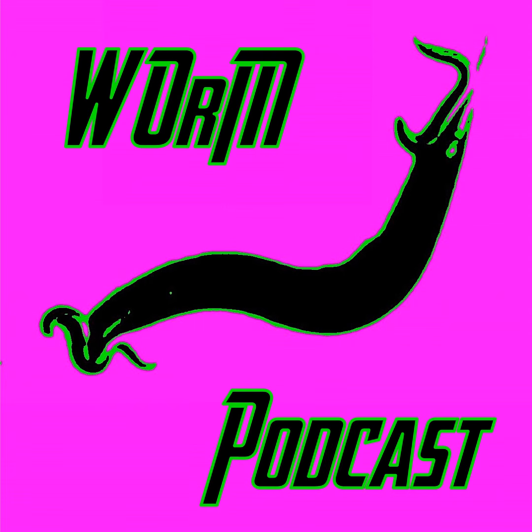Precisely. And in a filter that has 1 million pores, you are mathematically guaranteed to have thousands of these doublets. You cannot avoid it with track etching. So even if the manufacturer says these holes are 20 microns, that's just an average. The reality is you have a bunch of 40-micron failures just built in. Yes. And if just 1 or 2 of those gravid mothers falls through a doublet into your baby collection dish, your synchronization is ruined. You've got contamination.